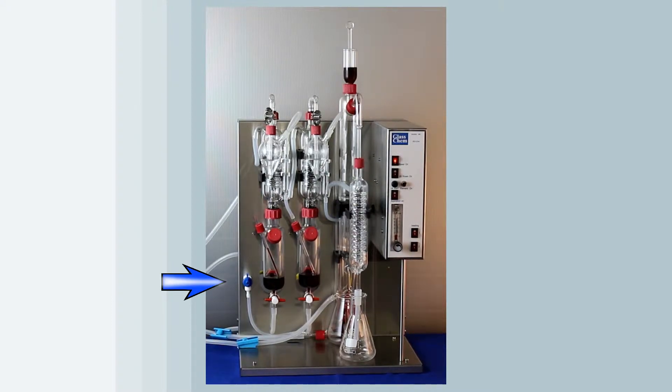This is the VA boiler fill valve. This is the incoming water and the outgoing water pipe. This is the VA waste chamber outlet and there is a two waste chamber outlet.